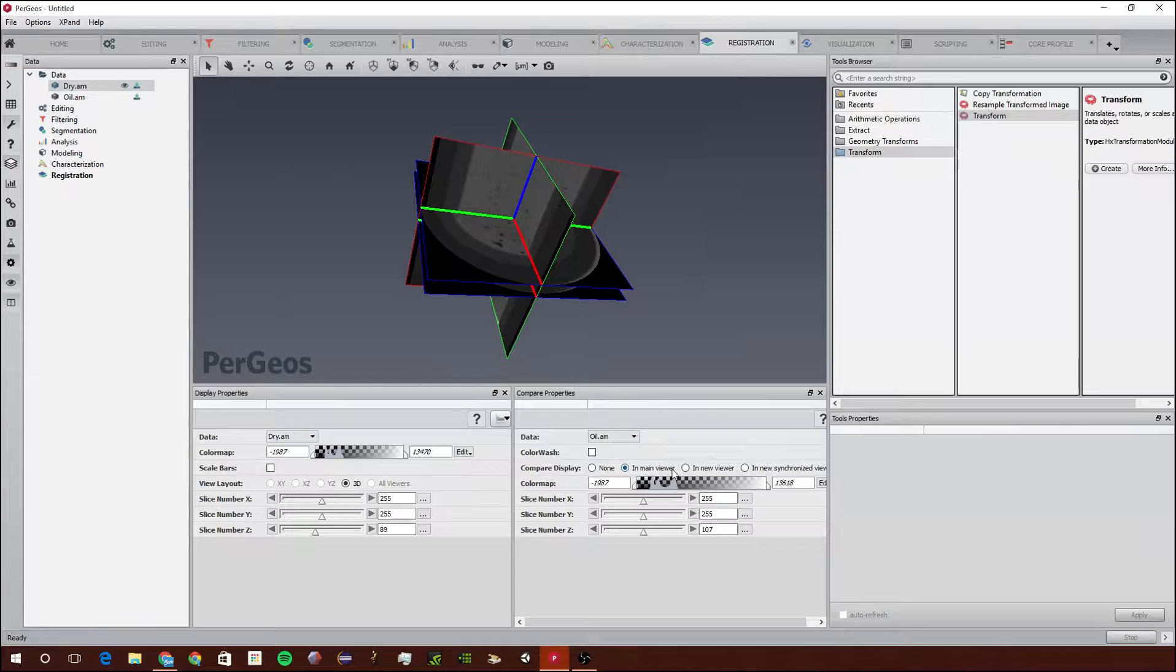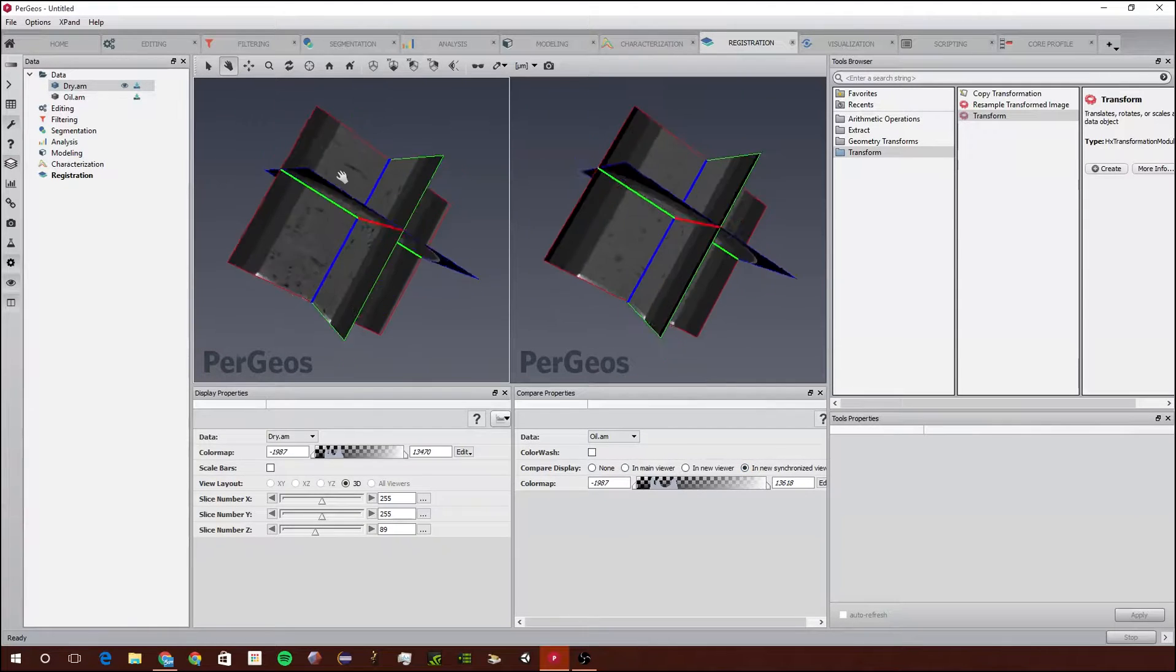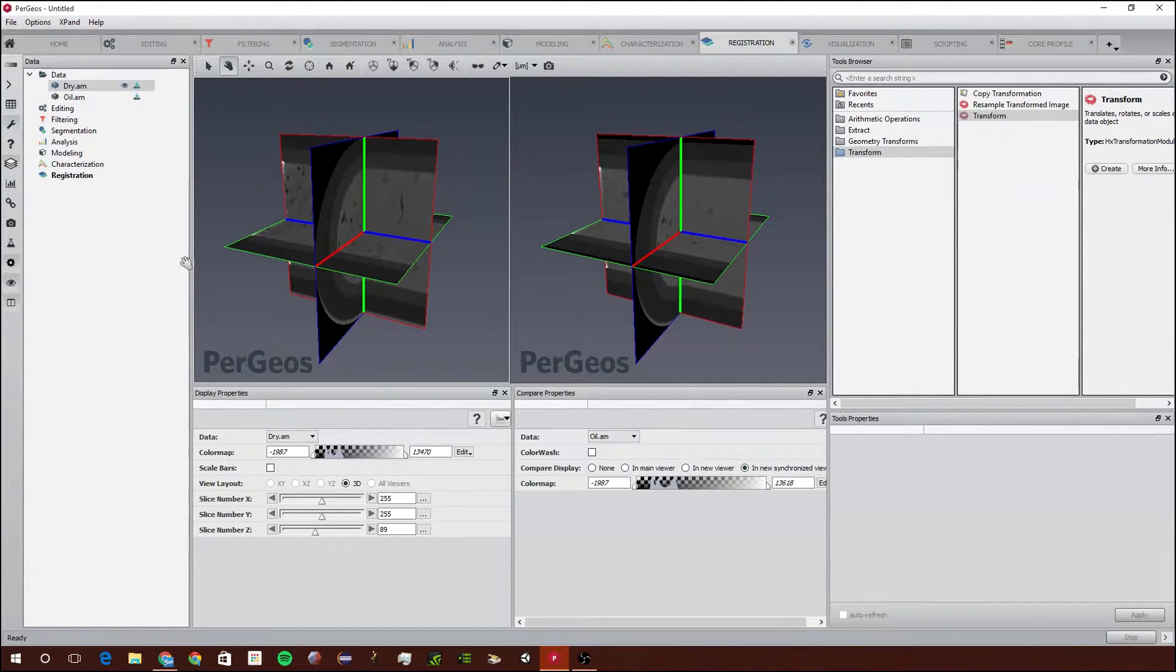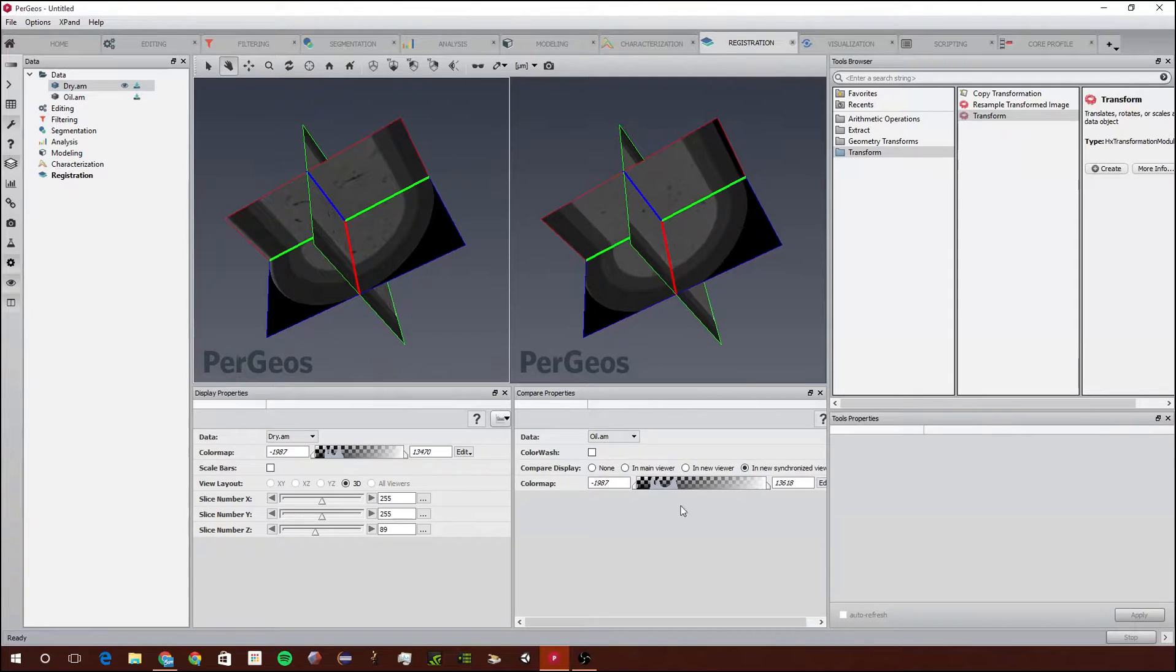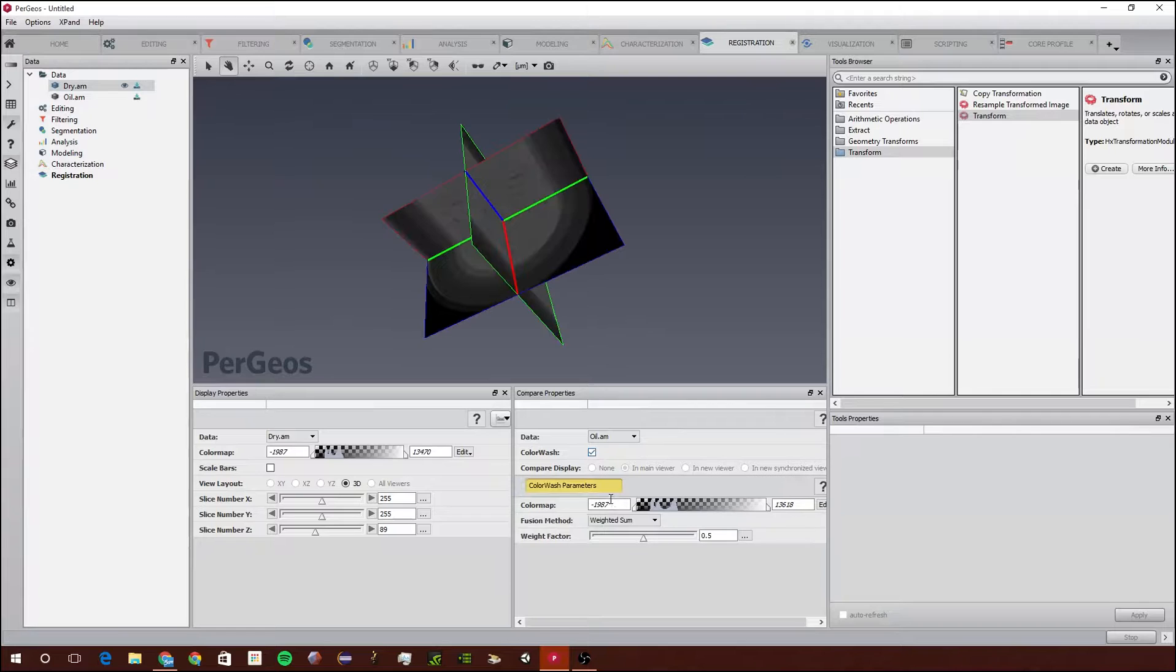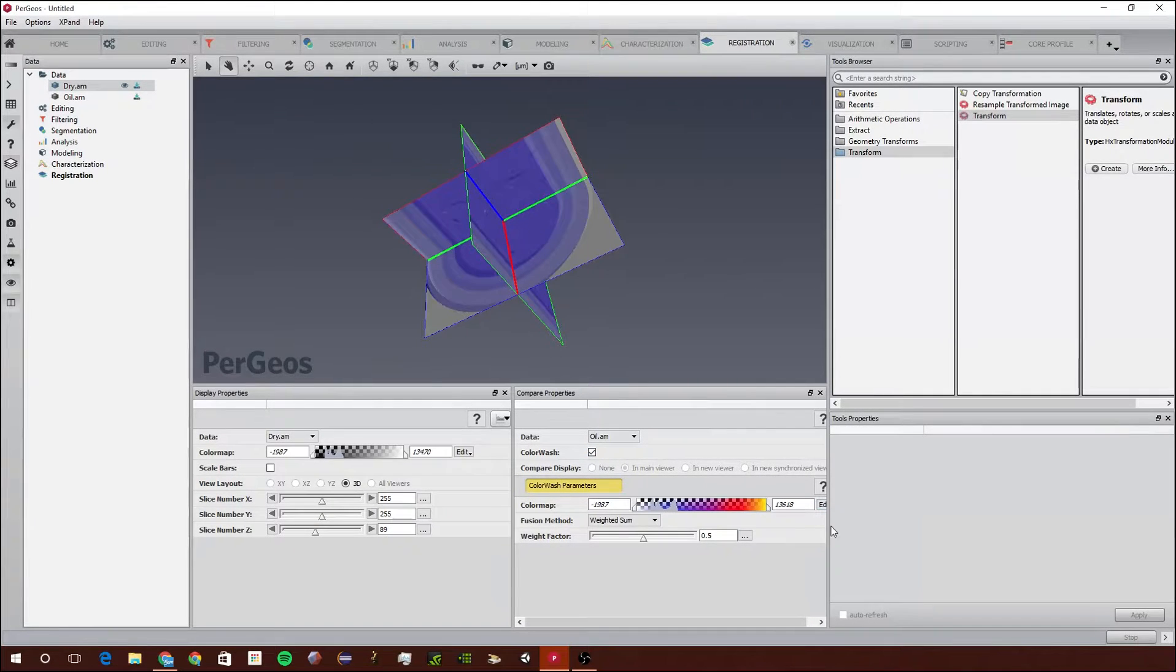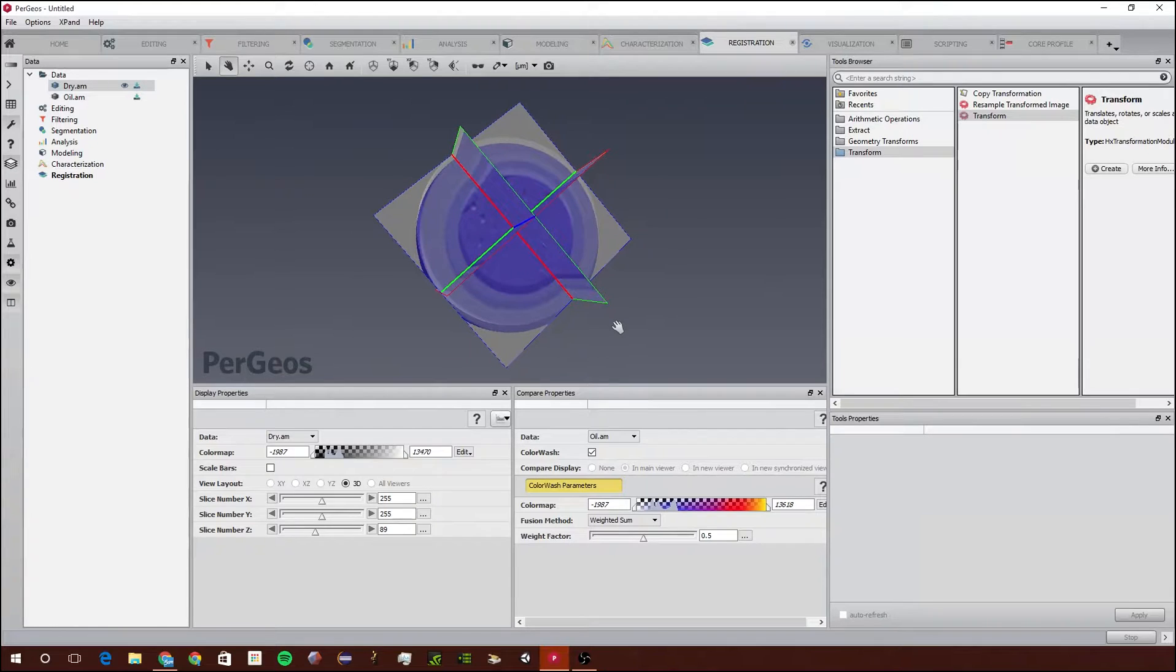There are many different ways we can visualize the two different images. The first way is having them in two different viewers and having them synchronized. You can also have them in the same viewer or we can use something called a color wash. A color wash will wash one image's values over another.